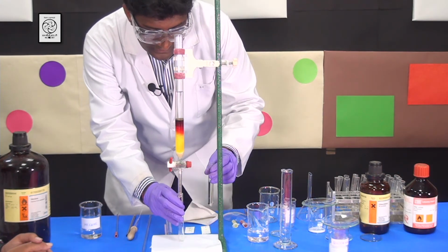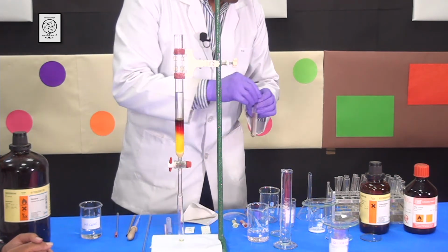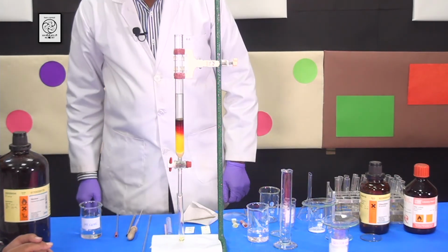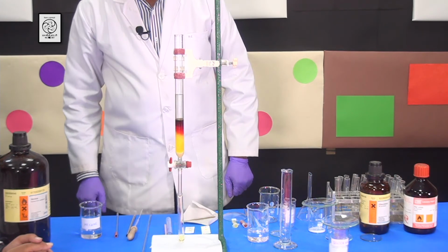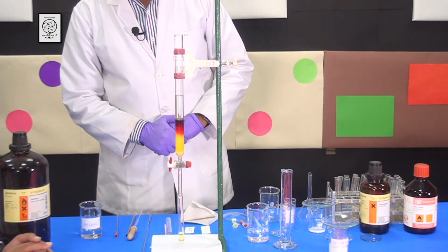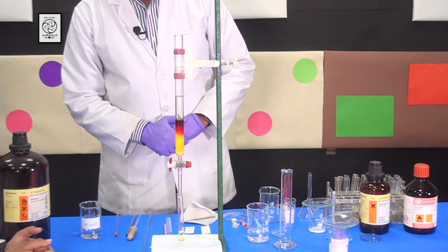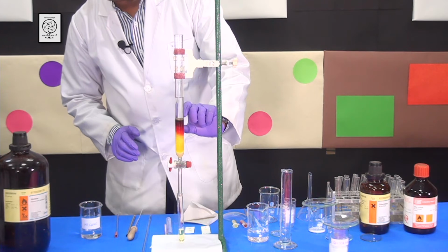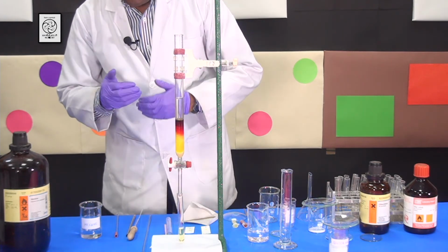Now I am collecting the first component, which is the yellow compound. You can see the red compound is actually stuck on the top because it is moving slowly.